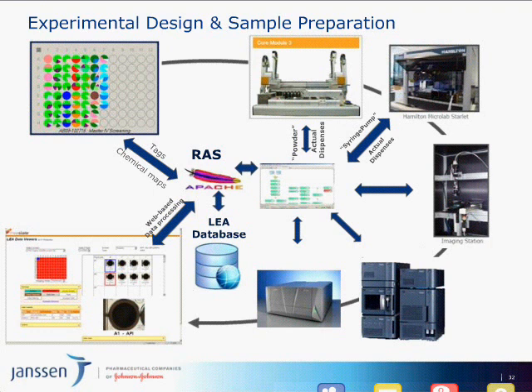After that, we can look to the LEA data viewer over here, and you see different images. So here it's experiment in duplicate and not in triplicate. Sorry. So we see the images. Here it's an example of not soluble, so you see still that there is API in the well. Unfortunately, there is no clear well here. So you have to go to a next step.